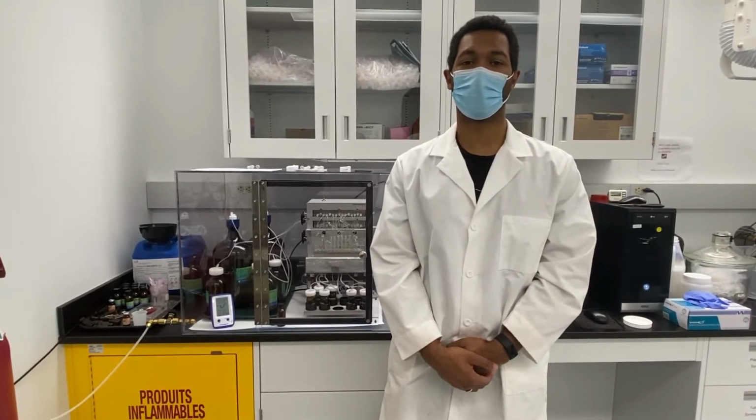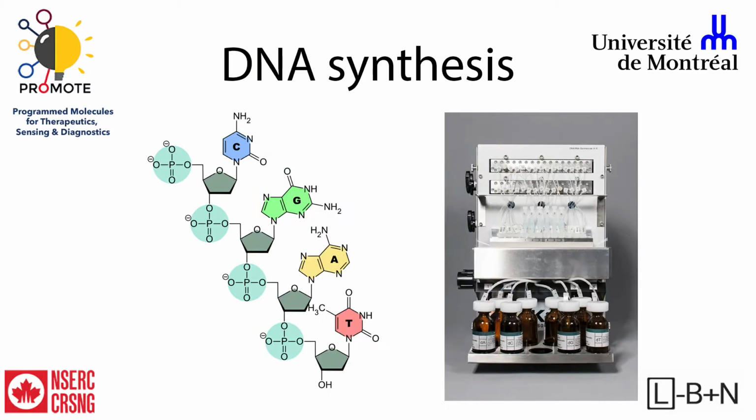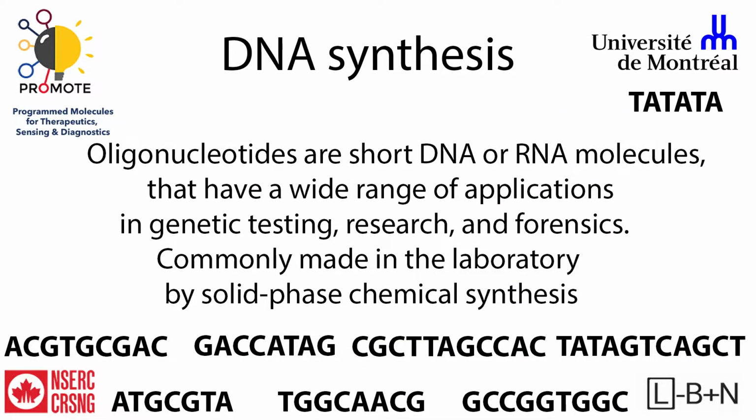Today we'll be going over the DNA synthesis procedure we use in our lab. This experiment enables a DNA sequence synthesis. Oligonucleotide synthesis is the chemical production of relatively short fragments of nucleic acid with defined chemical structure sequence. Typically, synthetic oligonucleotides are single-stranded DNA up to 100 mers in length.